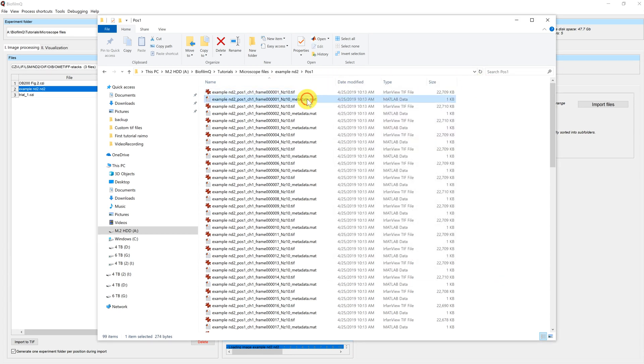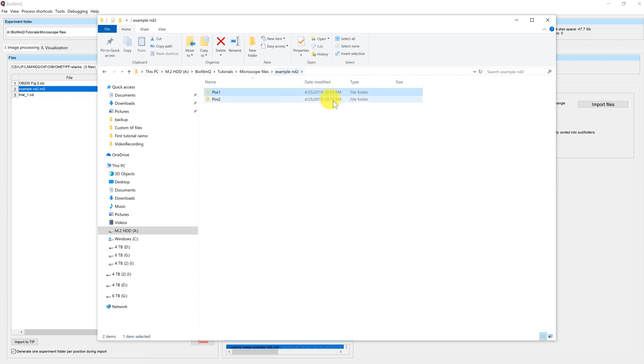And we have metadata files. These are MATLAB files that BiofilmQ needs, but you won't have to worry about them because BiofilmQ generates and updates them by itself. Now you can see that the second position folder has already been generated, and once all position folders are generated, we can go back to the GUI and see what happens. So now we'll just wait for that.